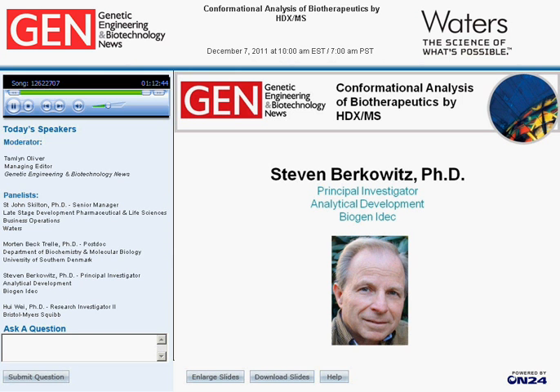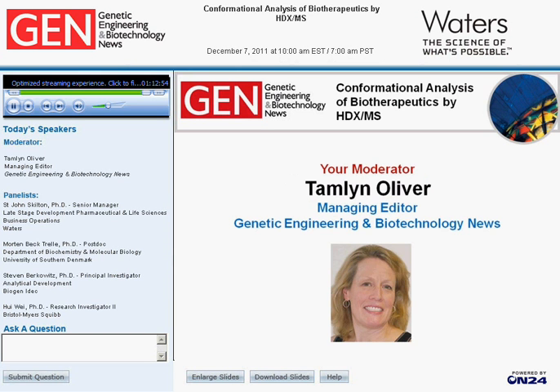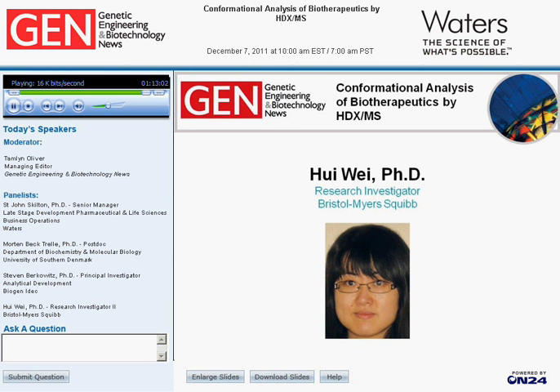Okay, Hoy, we have time for one more question, and I'll direct it at you. What is the experimental variability in terms of DA, so to claim the DA difference we observe is real? That's a good and very practical question. Based on my experience, for individual labeling time points, I usually see around 0.1 to 0.2 Dalton of reproducibility.